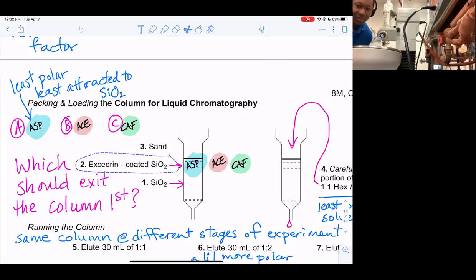All right, hey everyone. You hear me, right? Awesome. All right, so this is the rotovap. It's a rotary evaporator. You guys remember from Chem A or B, you're basically lowering the pressure, and so things boil at a lower temperature than what they normally boil at. So ethyl acetate, which boils at 77 degrees C, will now boil at a much lower temperature because of the lowered pressure. So it's a vacuum pump that pulls the pressure out, all the air out.